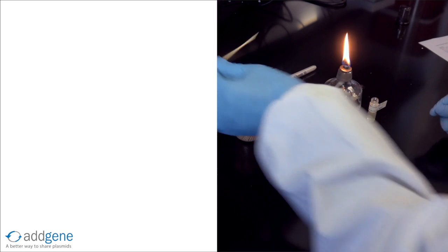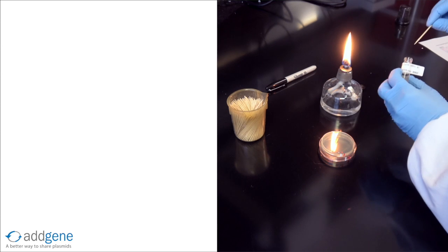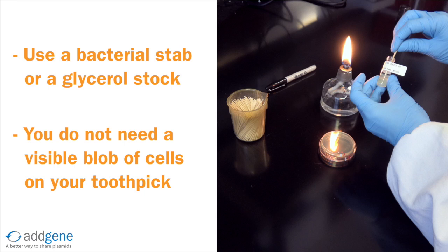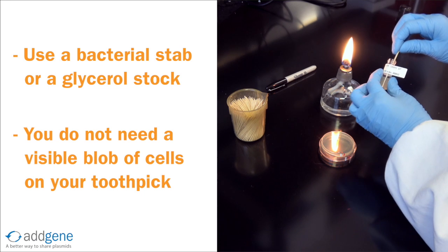Now, we take a sterile toothpick and insert it into the stab culture, dabbing at regions with bacterial growth. This could also be done with a glycerol stock by immersing a sterile toothpick into the semi-frozen solution. Remember that you don't need a giant blob of cells. A toothpick that looks clean is likely sufficiently covered in bacteria.